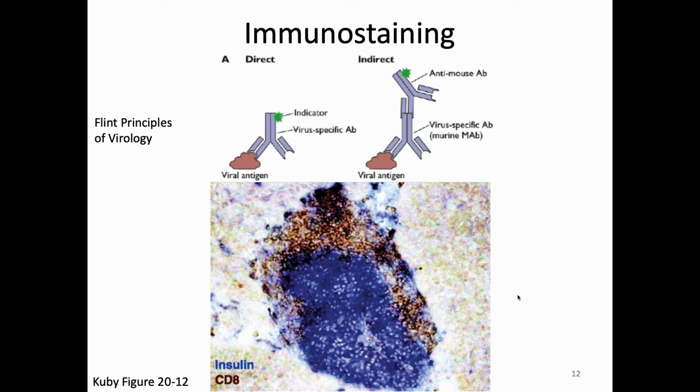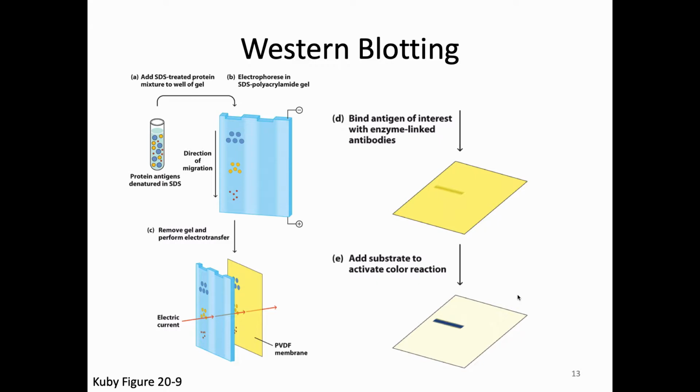if you have a tissue sample or if you have something that you want to look at in a microscope, but you might not have that. You can use the same principle if you have some cells and you want to look at their contents and you just lyse the cells. So you could take that same set of cells that contains a whole bunch of different proteins and you can lyse them. You also will denature them, and that's important to realize because that is going to change which antigens are available. And then you could run them on a gel, an SDS page gel.